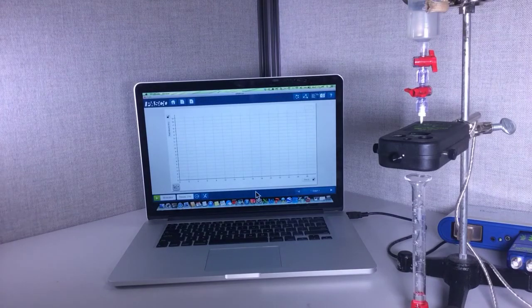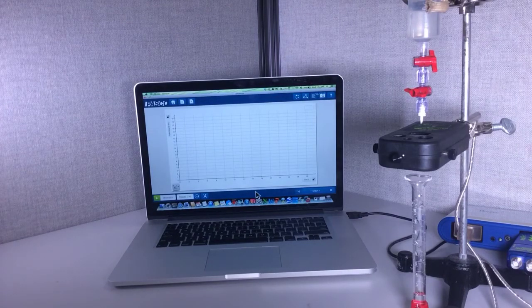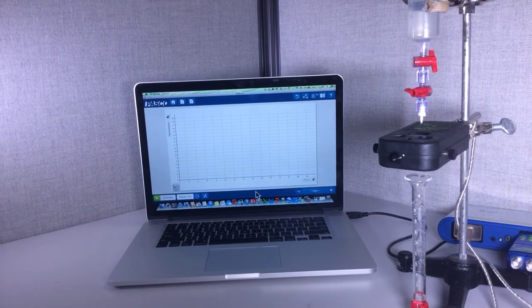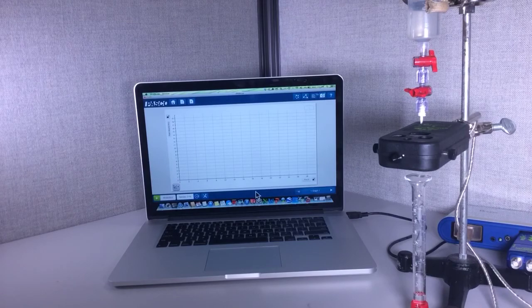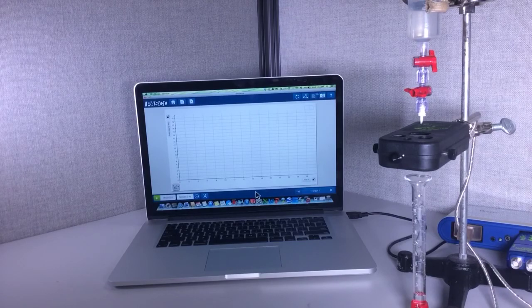When I hit OK my sensor is calibrated and it is ready for the titration. Thank you very much.